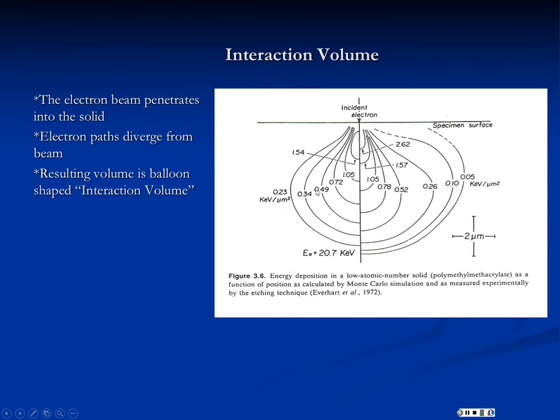And that is an issue because we have to recognize that the higher the power of our beam, the deeper the electrons are going to go, and whatever signals we are looking at are coming from where the electrons have gone. And that may not be the surface. We may be seeing a lot of signal that's actually generated from deep in the material. So you have to understand this basic relationship so that if you're trying to look only at surface effects, you turn the energy down. You want to minimize the energy of your electrons so they don't send you stuff from down here deep in the material.